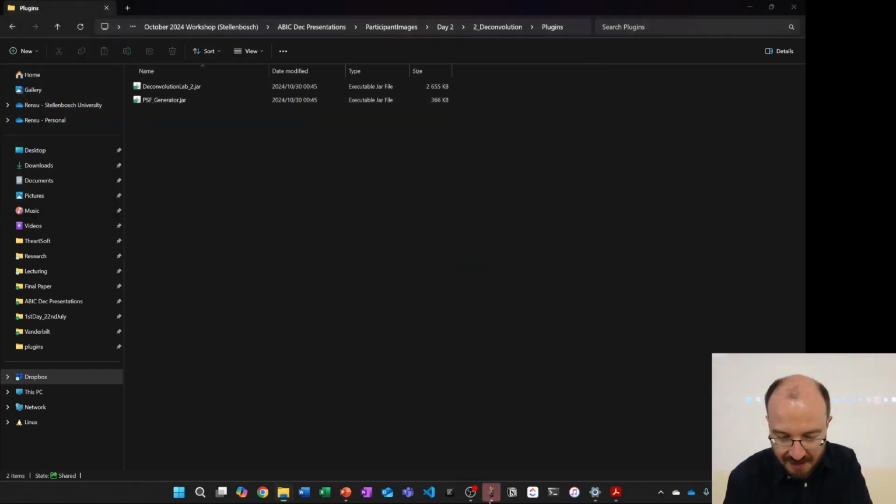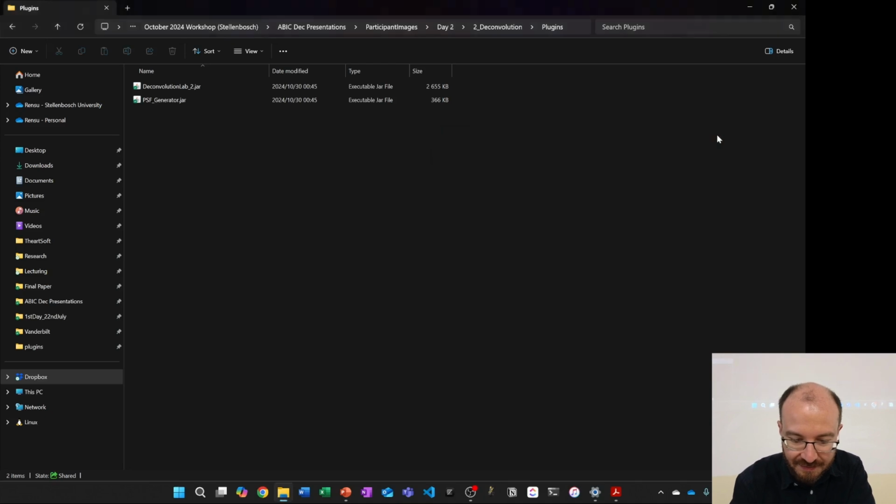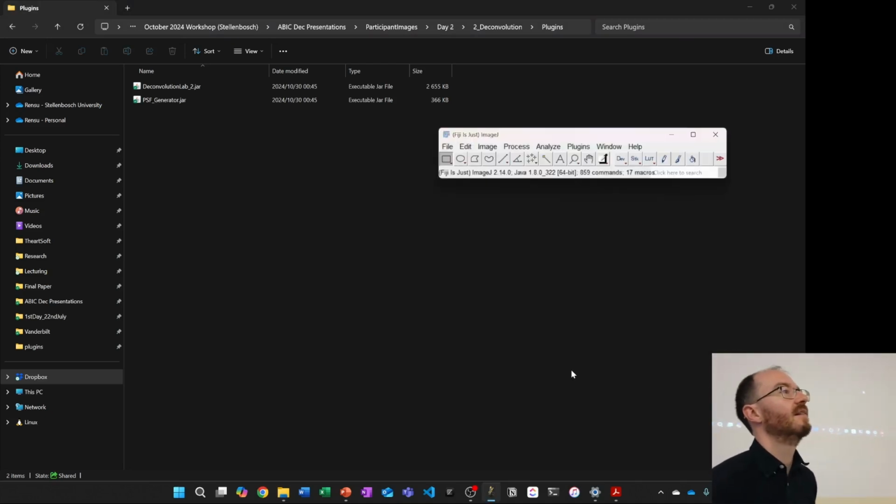I'm going to give you just a moment to do all of that. Once you've done everything, you just need to close Fiji and reopen it. Otherwise, it's not going to reflect. So, I've got everything done.